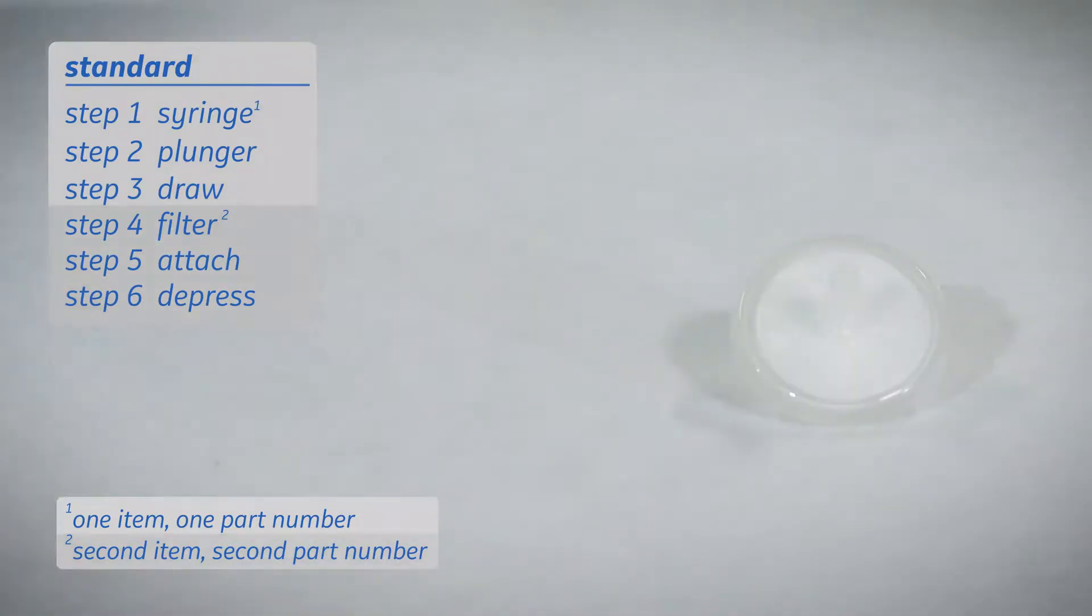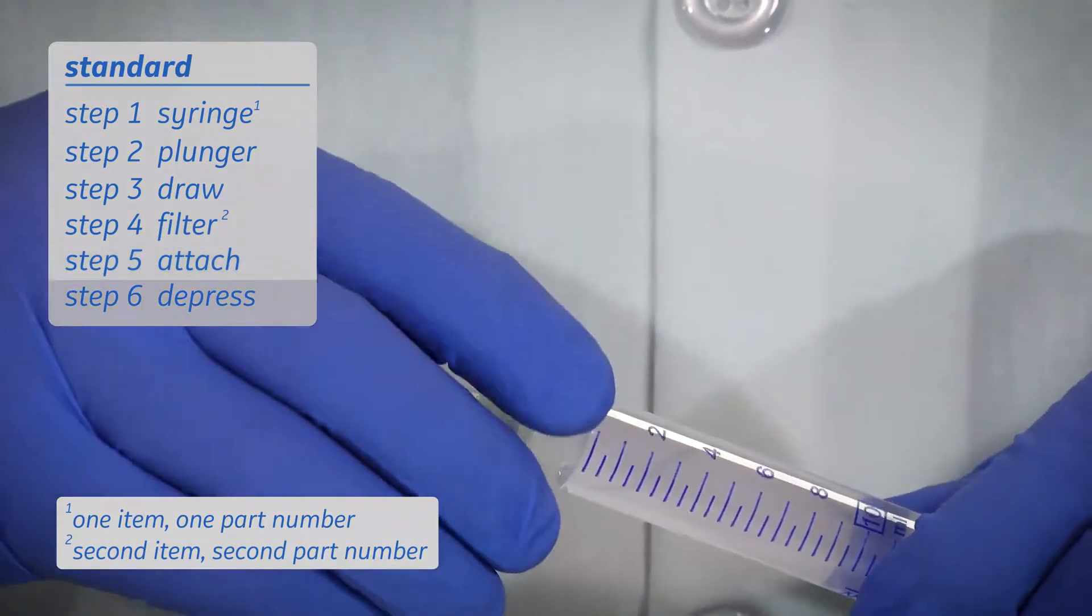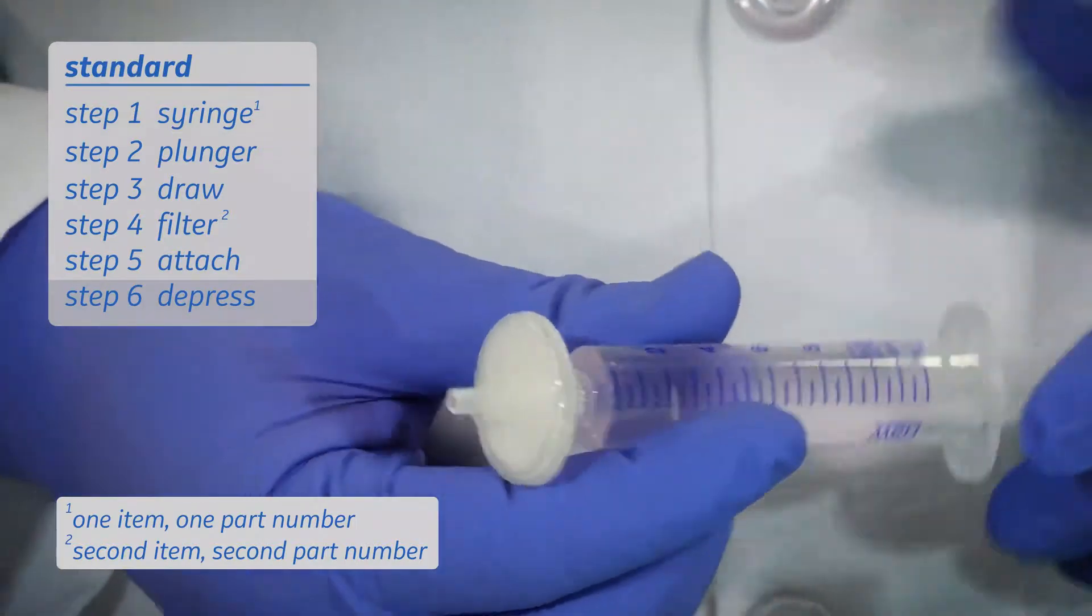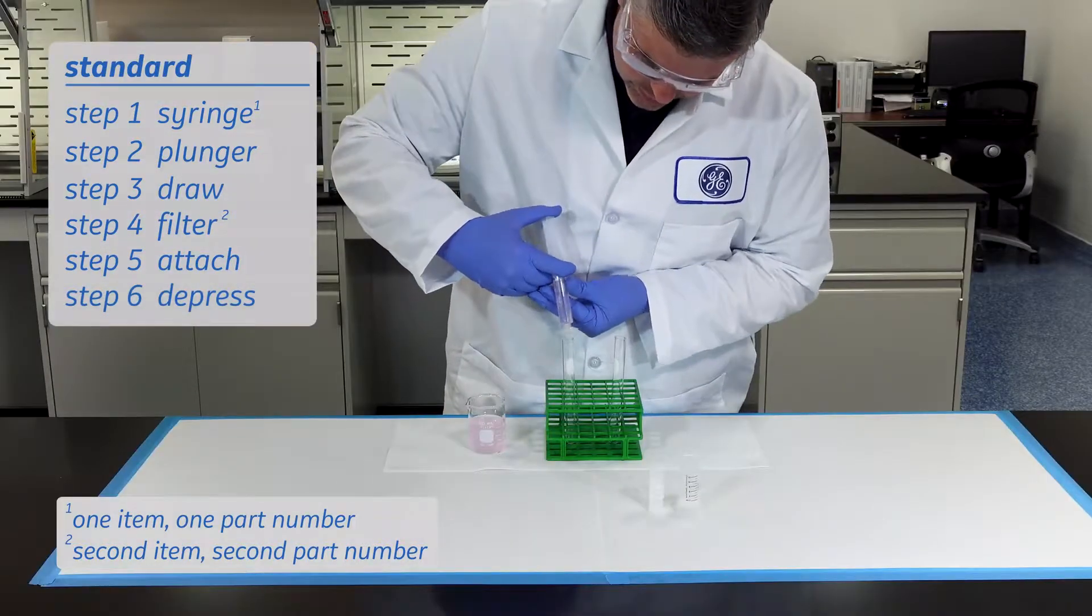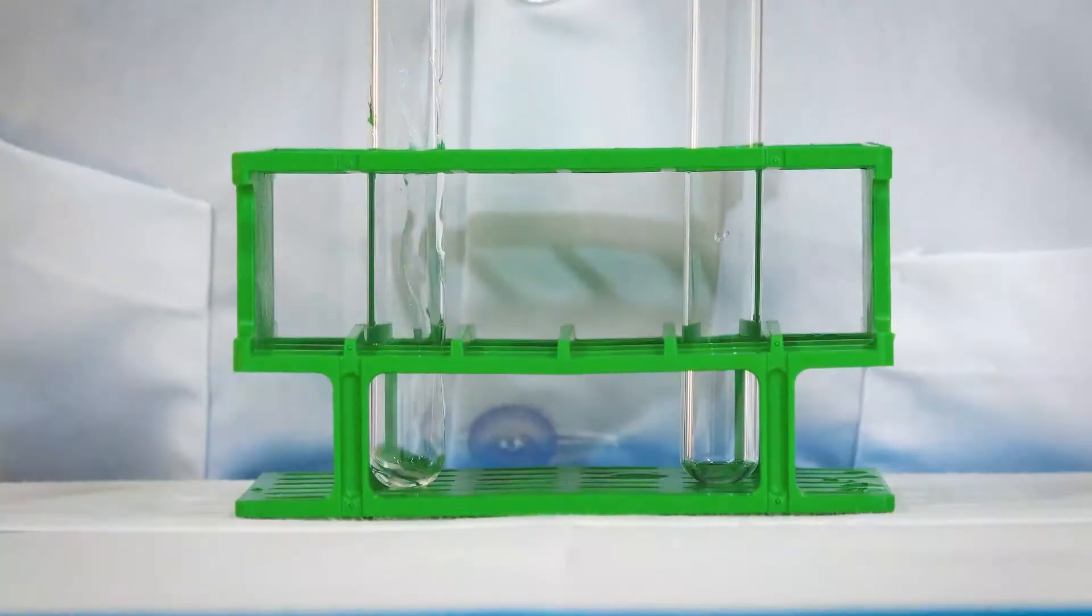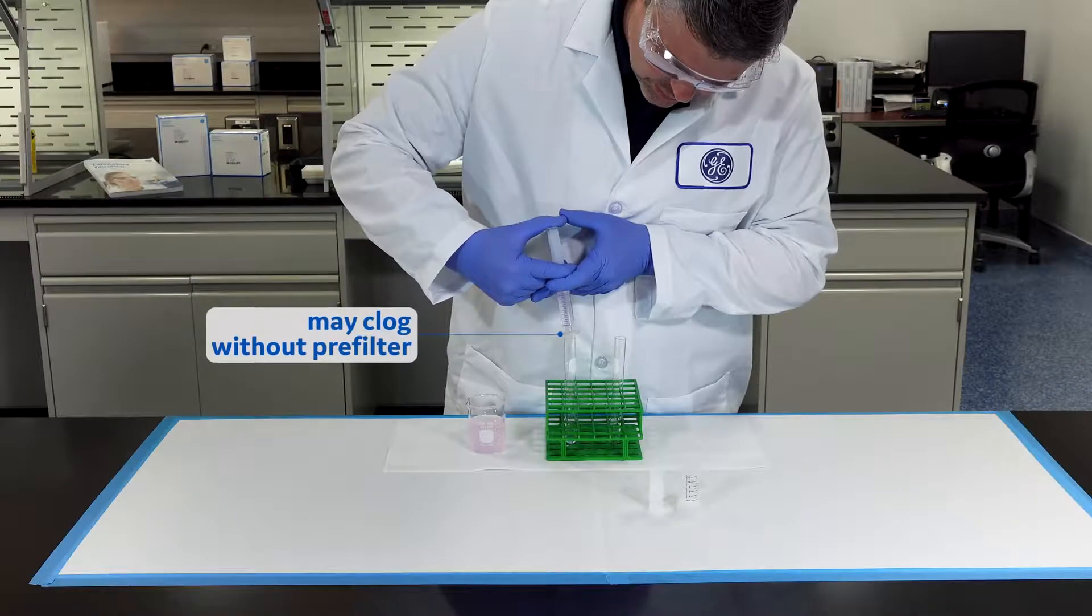Now retrieve the syringe filter and place it onto the syringe by using the slip luer fitting or luer lock on the end of the syringe. Now depress the plunger, filtering your sample. Without a pre-filter, the standard syringe filter may clog as it does here.